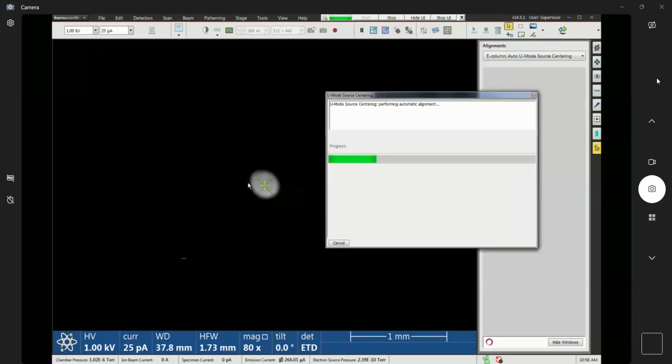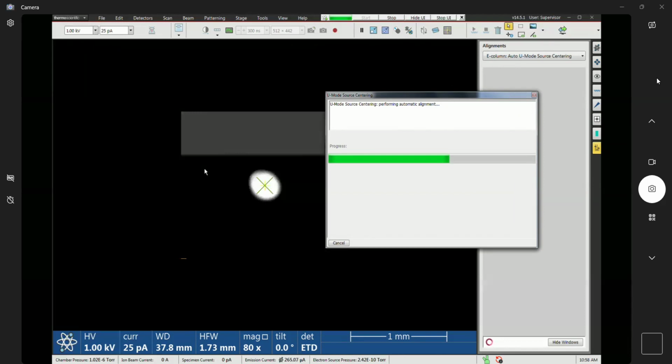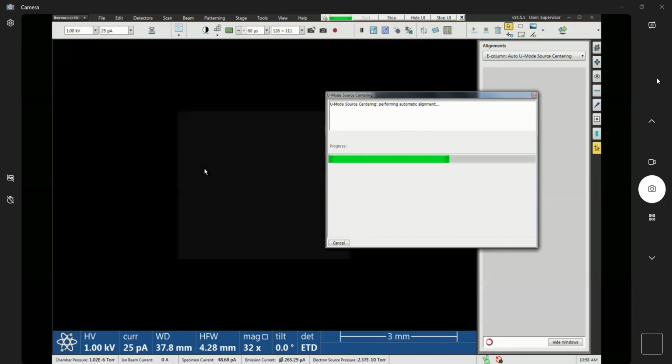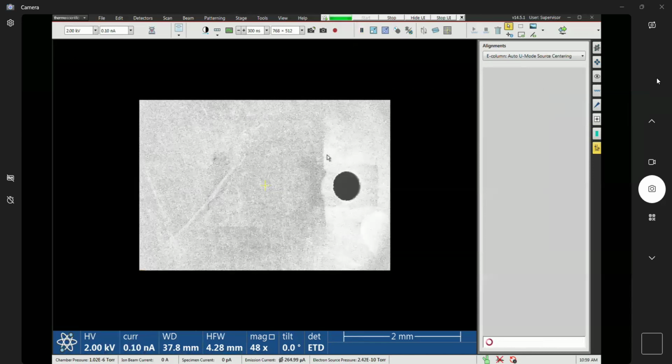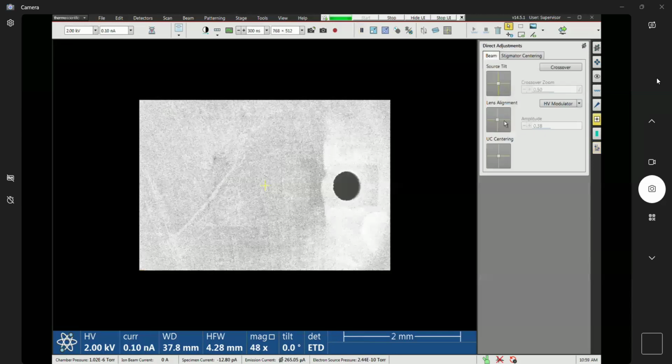Okay, so there's the spot. Okay, so we're all done.